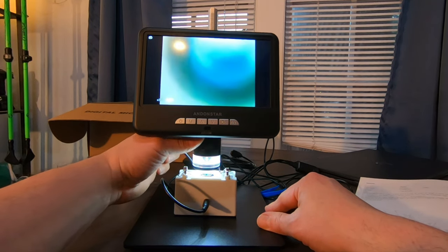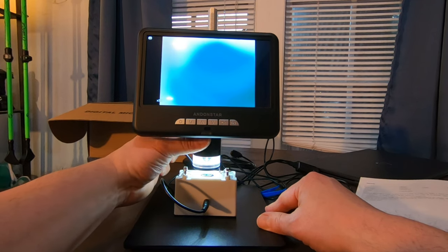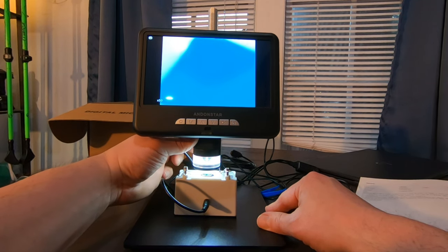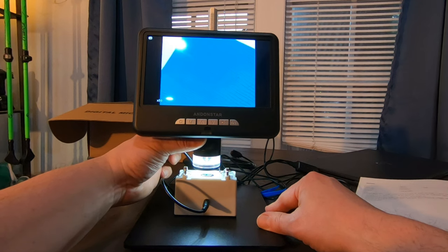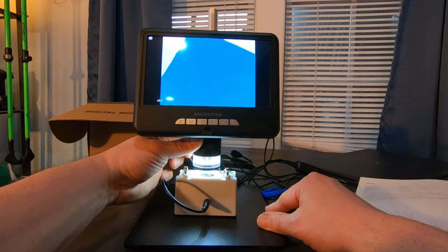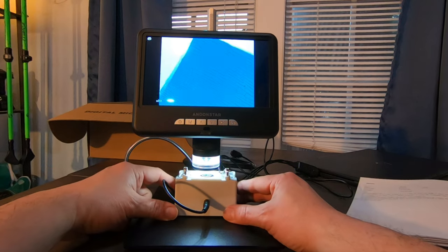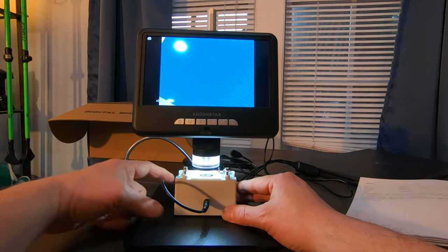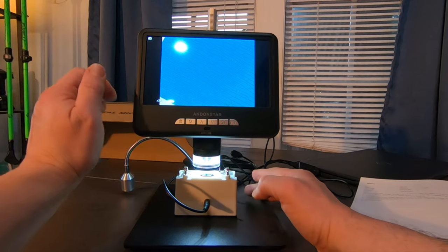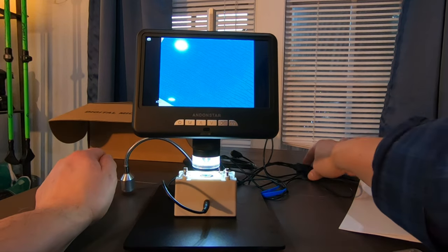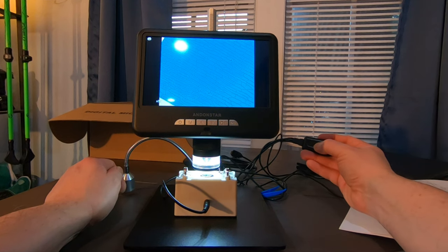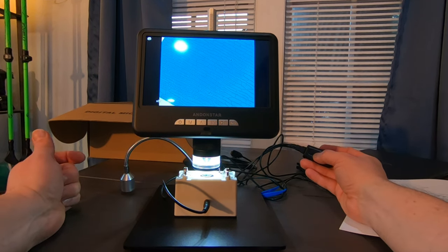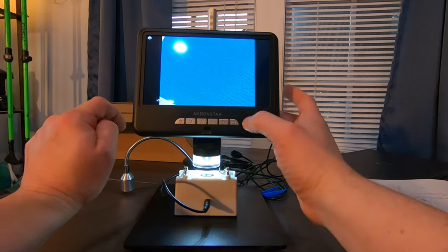Okay. That's not what I want. Oh, wow. This is cool. Look at that. Getting really close up now. So now I can really see those cells. Look at that. There's the nucleus. Isn't that nice? That is so cool. Let's see if we can make it brighter. So I've got the brightness all the way up. Okay, the brightness is all the way up.